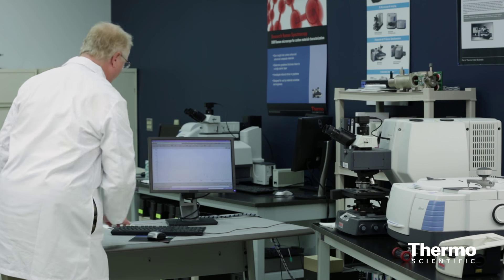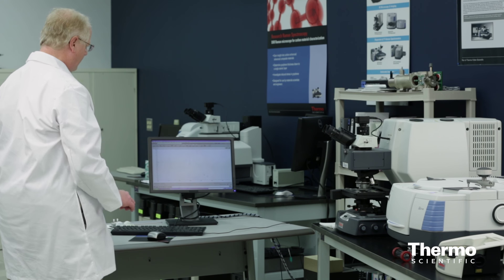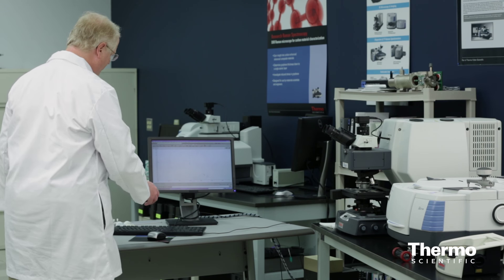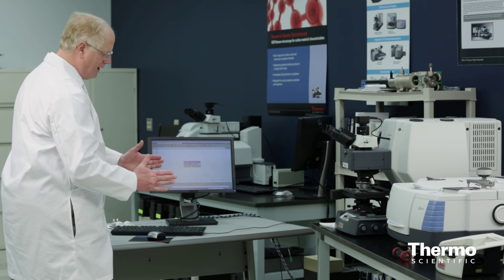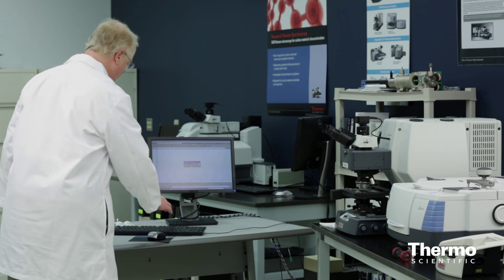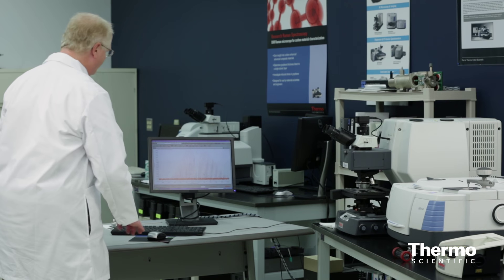I've already run a background so I don't have to worry about running one again. In a moment you'll see a little box pop up that says it's collected. This is taking a while because the mirror has to move a long distance at high resolution to get in a high res scan. I'll just leave the default name and I've got it set so that it zoomed right in on the carbon monoxide spectrum.